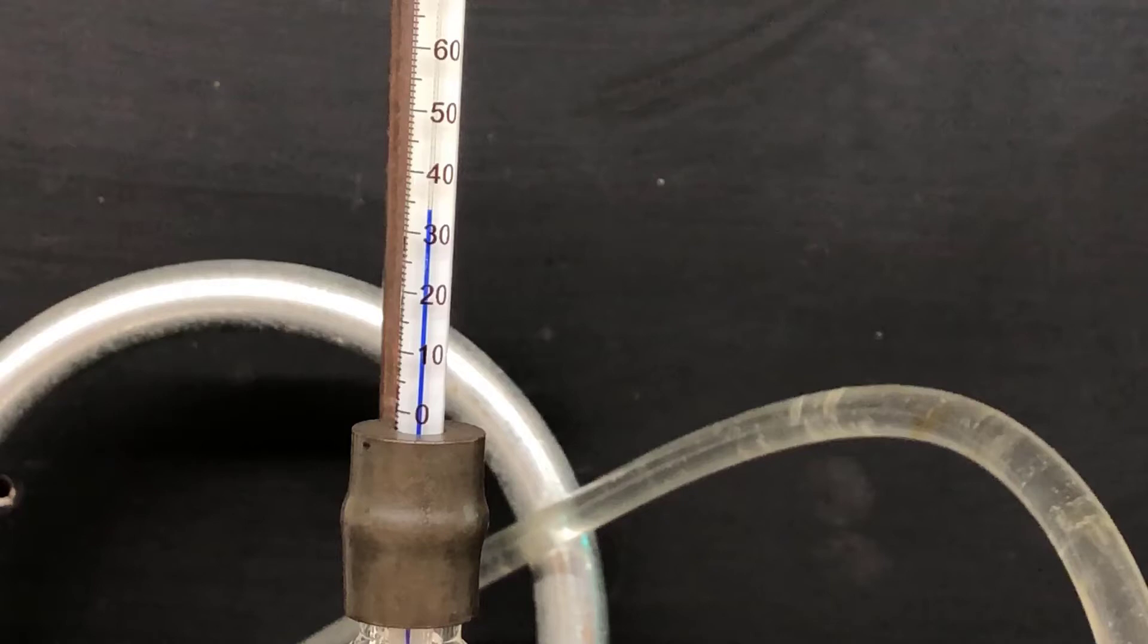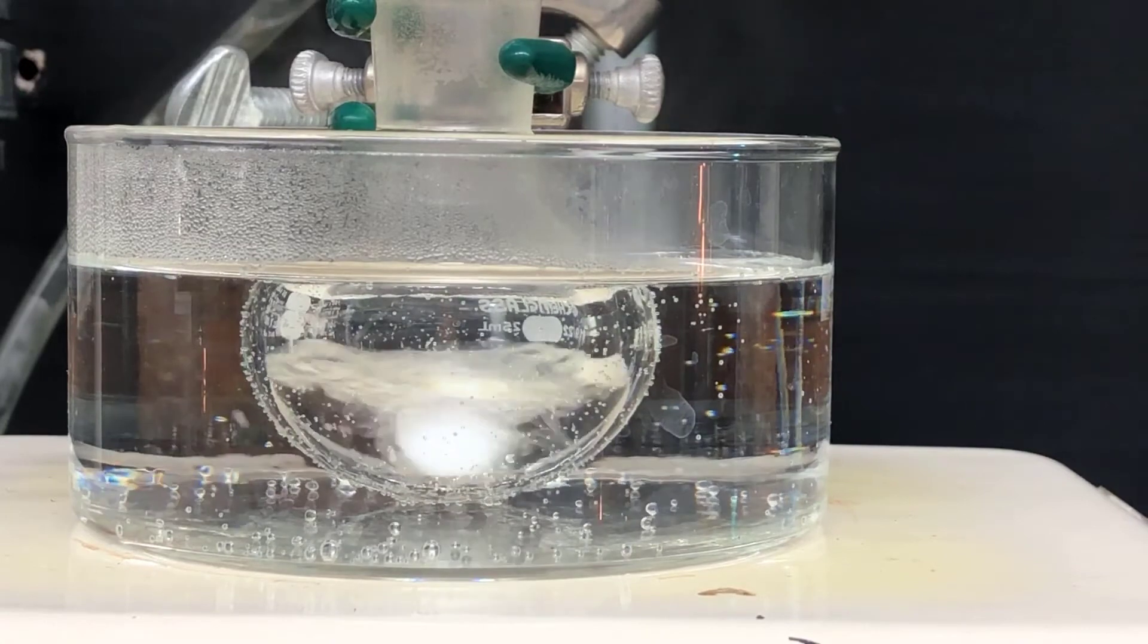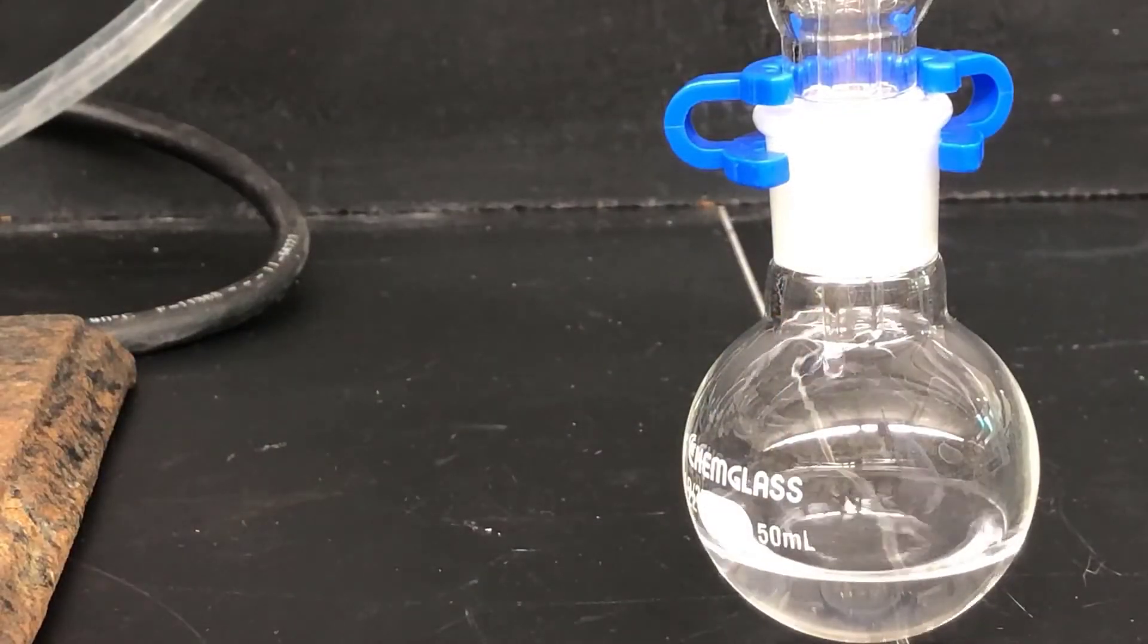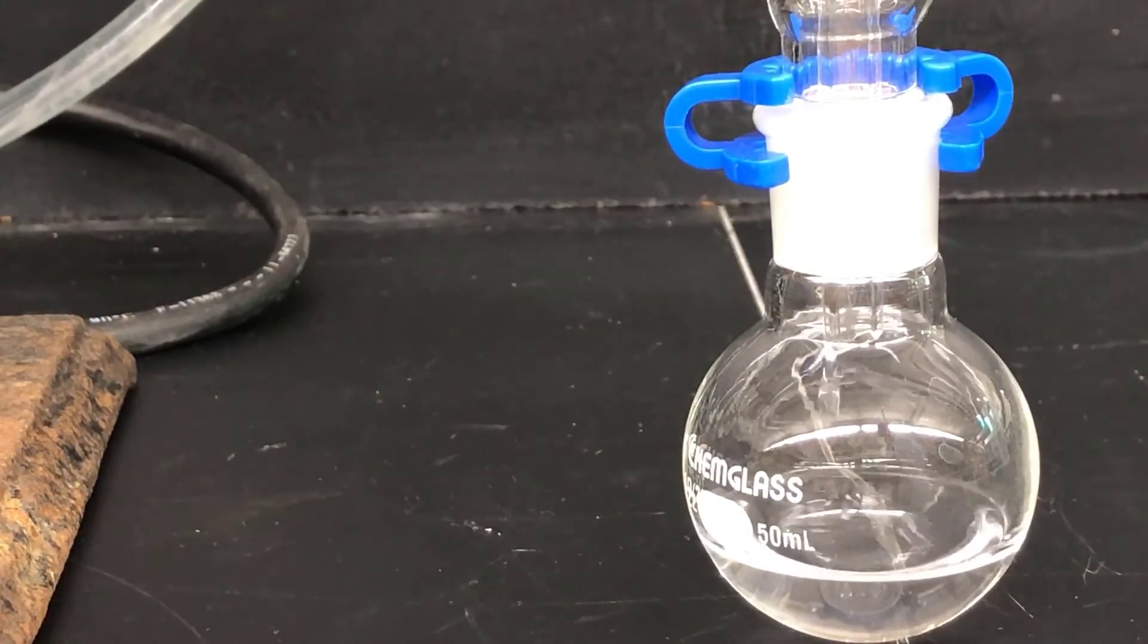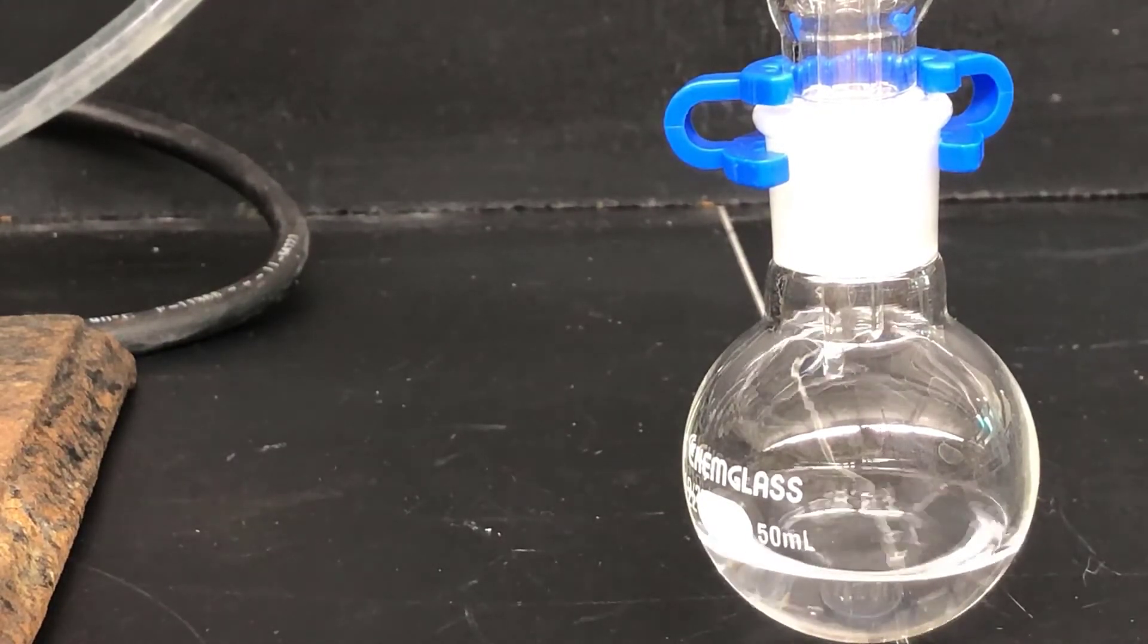Here the solvent has started distilling at about 34 degrees. Here I'm showing a side view of the distillation in progress, and here I'm showing the solvent dripping into the collection vessel. A drip rate of one to two drops per second is just about right for distillation.